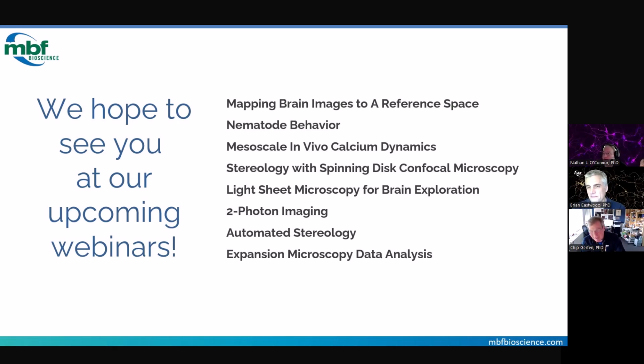It's myself and Ron Piletsky who works with me. We can process typically 5 whole mouse brains a week. That's from cutting through imaging and everything. Cutting a brain, fixed, frozen, takes about half an hour to cut a brain into serial sections.